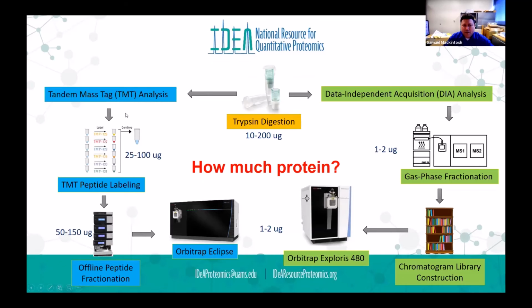In cell culture, that's usually easy, but with your setup, that sounds like it might be more difficult. With the data independent approach, because we don't have to label and we don't have to fractionate, it is more forgiving in that regard. We'd still like to have 10 micrograms total protein per sample to get a good reproducible trypsin digestion across the sample set. But obviously that requires a lot fewer cells. So does that sound like it's in the vicinity of reasonableness for what you need to do?